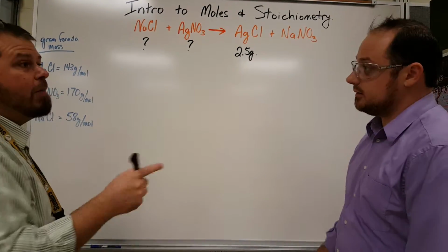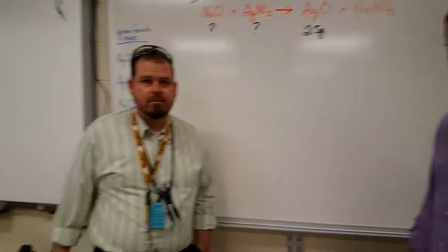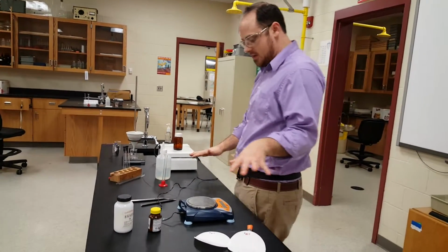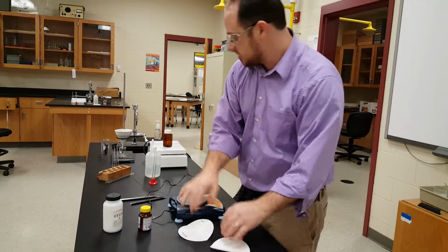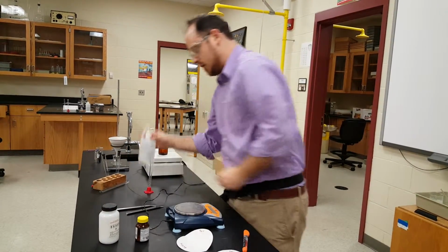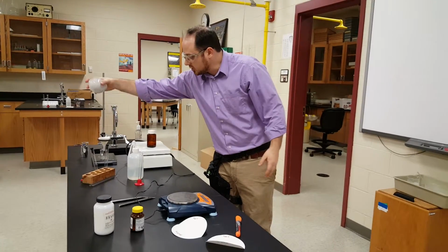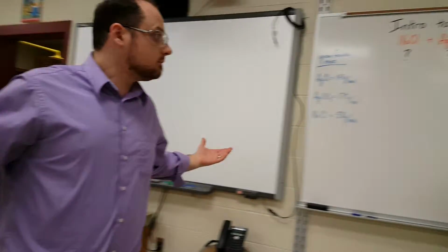How much in grams does Mr. MoNaCo have to do in the lab? Let's show him the lab real quick. Don't mind the mess. So I'm going to weigh out all this stuff while Mr. Milks does the mathematics. He's going to tell me how many grams of each to put on my weigh papers, that I can put in my test tubes, which I can dilute with my water, and then react in this vessel that's dark because it keeps the light out. And then I'll filter it and dry it out overnight, and we'll have a second video to see if we did it right and see how much we made.